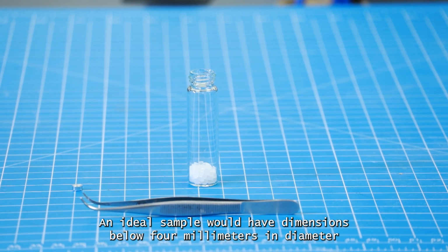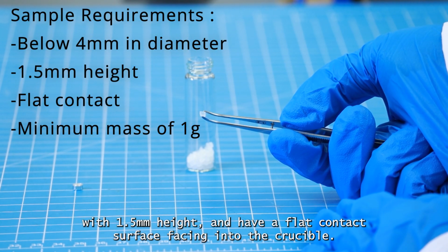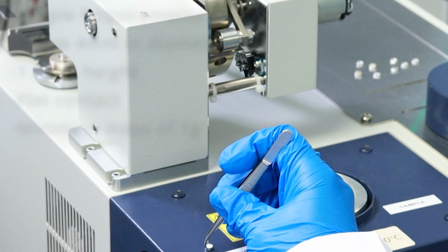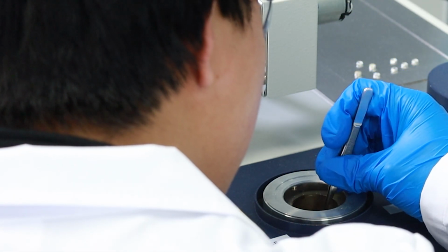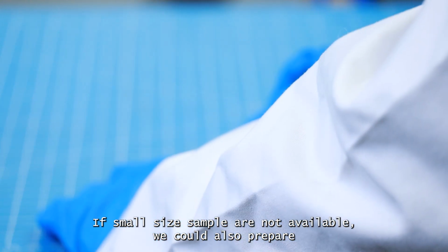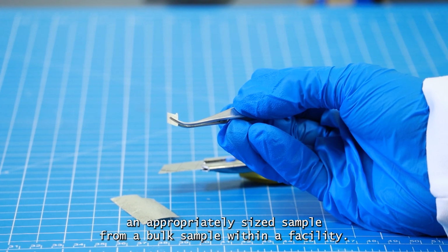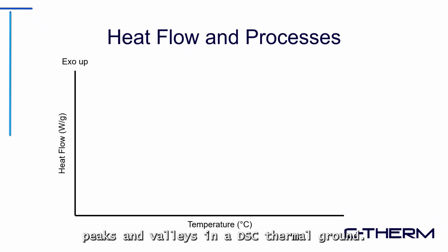An ideal sample would have dimensions below 4 mm in diameter with 1.5 mm height and would have a flat contact surface facing into the crucible. For each sample, a minimum mass of 1 gram is recommended. If smaller size samples are not available, we could also prepare an appropriately sized sample from a bulk sample within a facility.